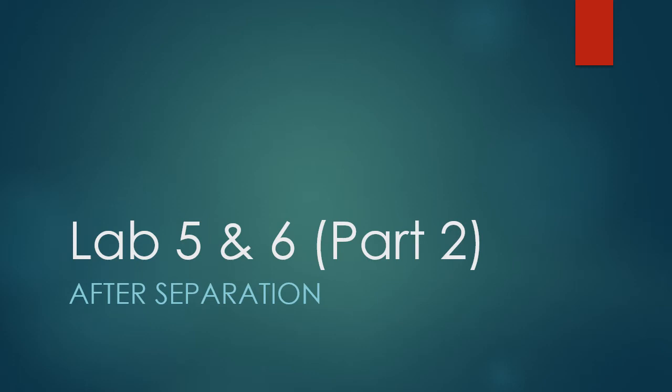Lab 5 and 6, Part 2. We'll be collecting the data for after the separation. So once we have left all three components to dry for the week, we come back to get their masses.